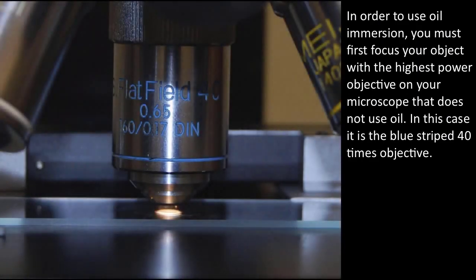In order to use oil immersion, you must first focus on your object with the highest power objective on your microscope that does not use oil. In this case, it is the blue striped 40 times objective.